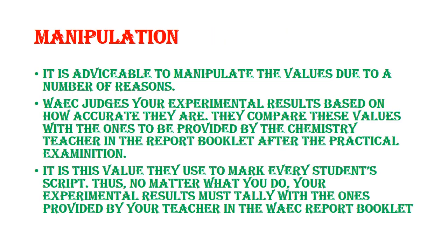And now we get back to the business of the day, the manipulation. This manipulation is to give you an accurate value, because most times we find out that when we conduct the experiments, we get values that are far from each other and are less accurate. So that's why I'm here to teach you how to manipulate the values to get a reading that is very, very accurate. Now it is advisable to manipulate the values due to a number of reasons.